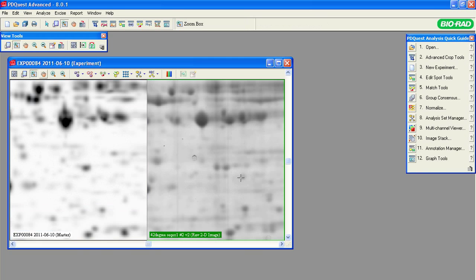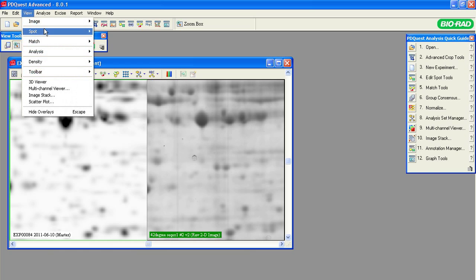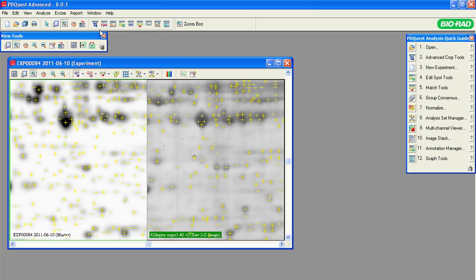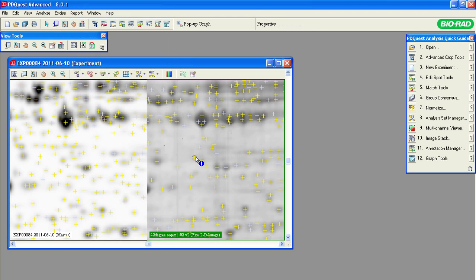Zoom in on the area close to the center of the gel to see the details. Notice that there is a bubble on this gel. Press F5 or select View, Spot, Show Crosshairs. To see how PDQuest software detected this spot-like feature within the gels, point to the crosshair inside the bubble, then select the Report, Pop-up Graph, or click F10 on your keyboard to select the artifact.